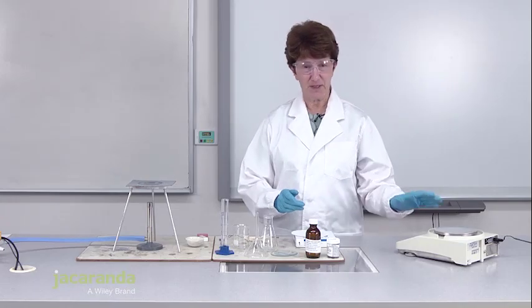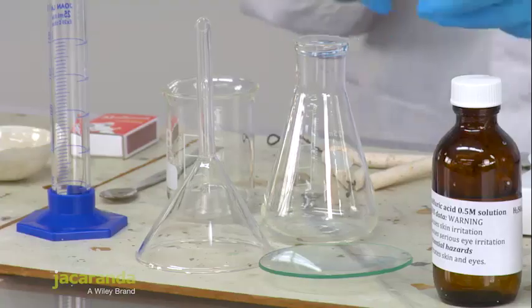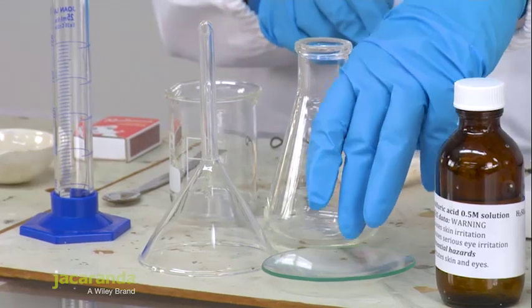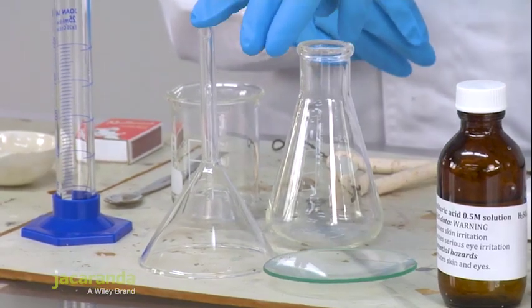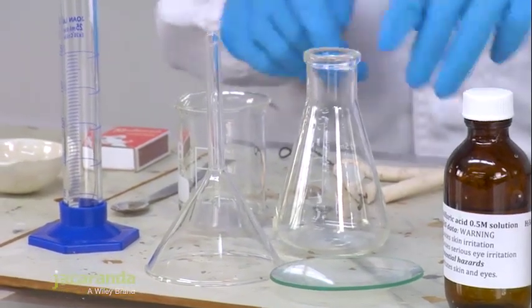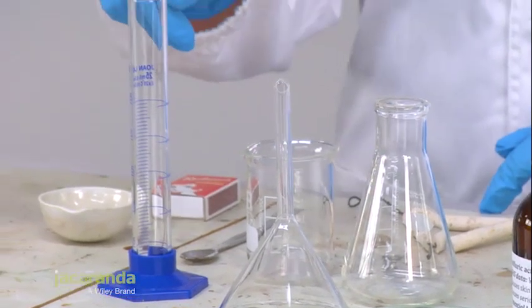To weigh out copper oxide we need a balance. The glassware that we're going to use involves a watch glass, a filter funnel, a conical flask, a 100 mL beaker and a measuring cylinder.